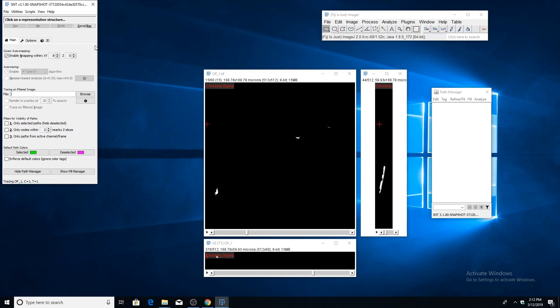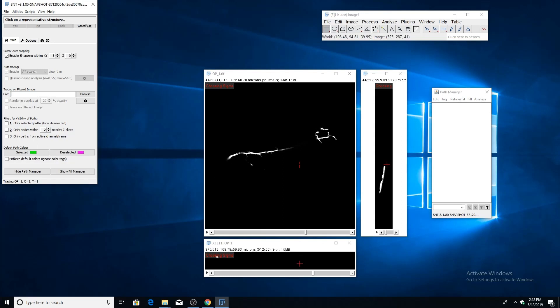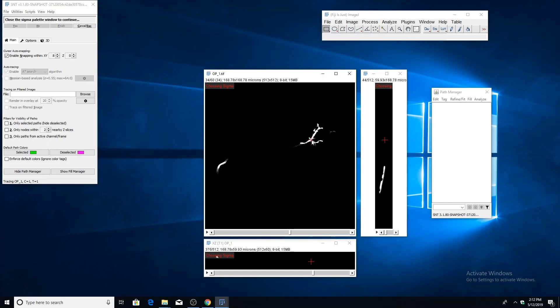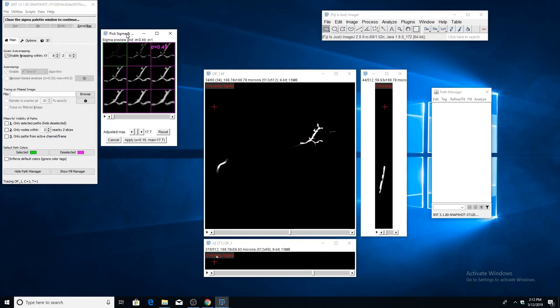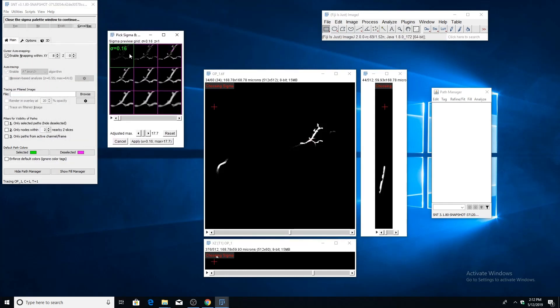If you select that option, it will ask you to click on a representative region in the image that has meaningful structure. Scroll through and find a region that has some interesting branching going on and click in the middle of it. You'll see this palette being generated which shows increasing values of Sigma applied to that portion of the image.